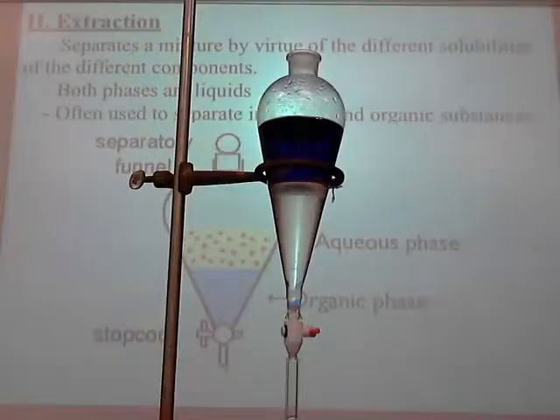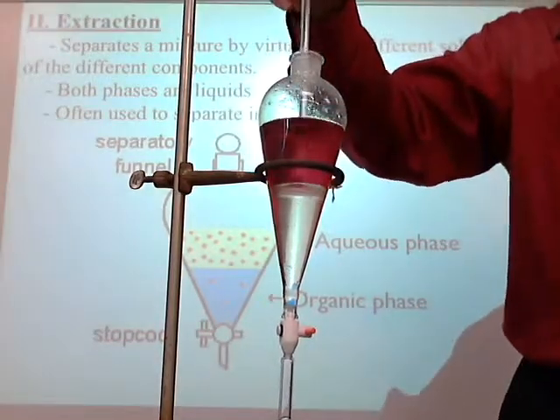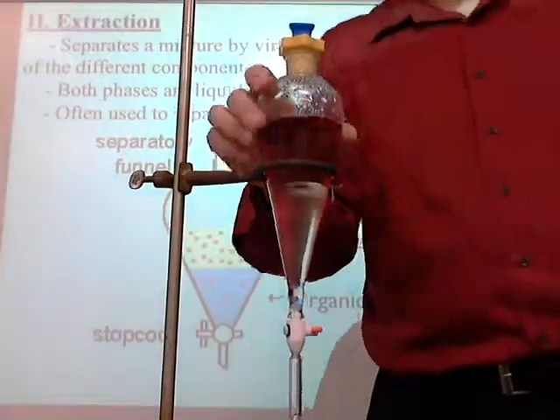Anyway, I add the hydrochloric acid to it. And if you watch, I stir it up like this. See what color it changes? It's red, actually. All right, so now it turns red. That's cool. If I put the lid on, watch again.